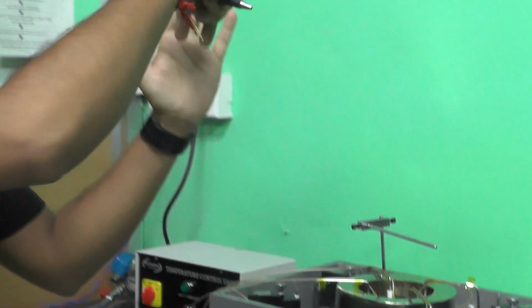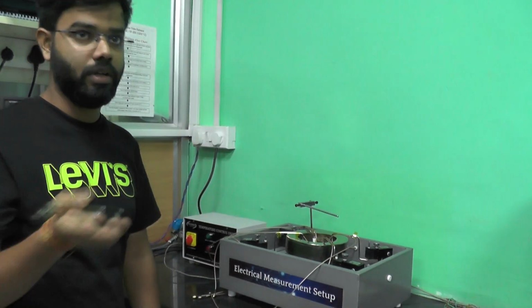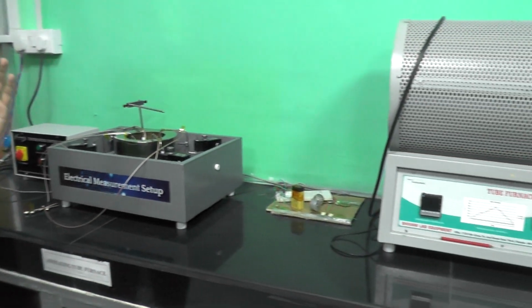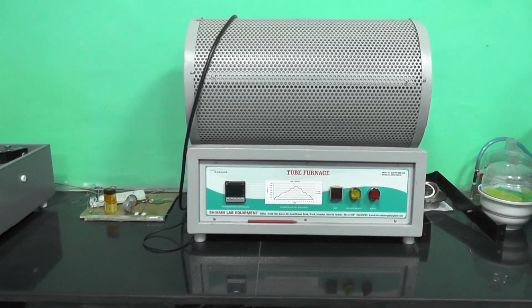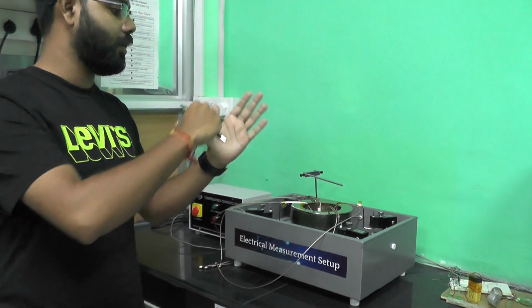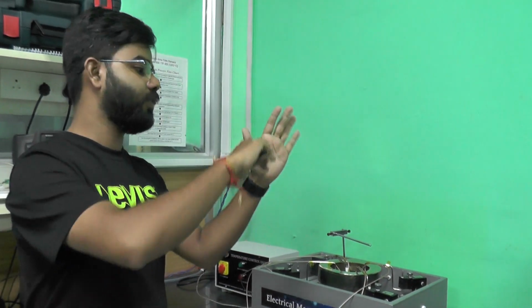So in this method we are sourcing and we are measuring, and then after that, as you have seen already in the theory part, how we are measuring the sheet resistance that we are getting. So in this system, as far as the Van der Pauw method is concerned, we are using multiple cases, as the cases also have been discussed by sir, where we are just switching the four probes.